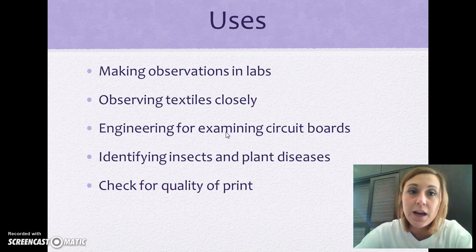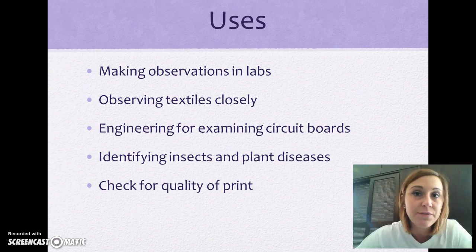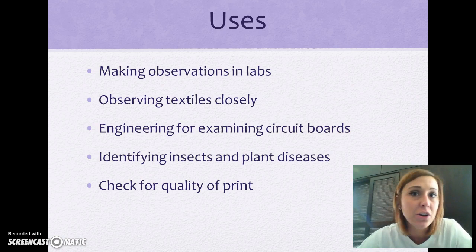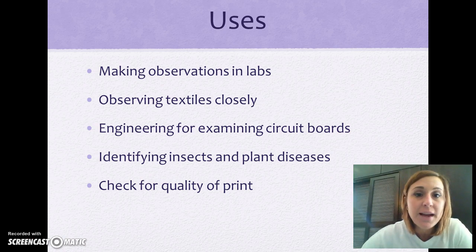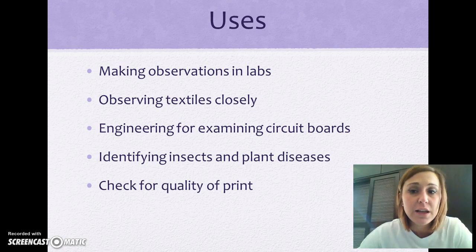Some uses: obviously you can make observations in labs. You can also observe textiles if you're in some kind of textile class. It's great for engineering, for examining circuit boards, identifying insects and plant diseases, so a botany class or something like that. And then also to check for quality of prints.